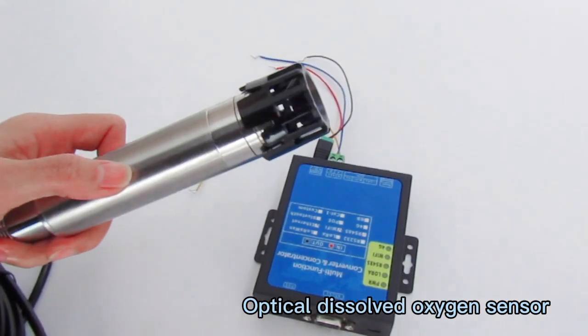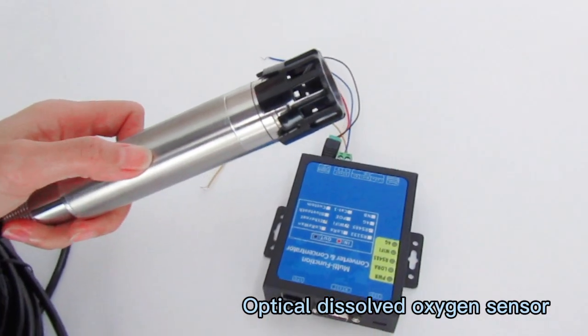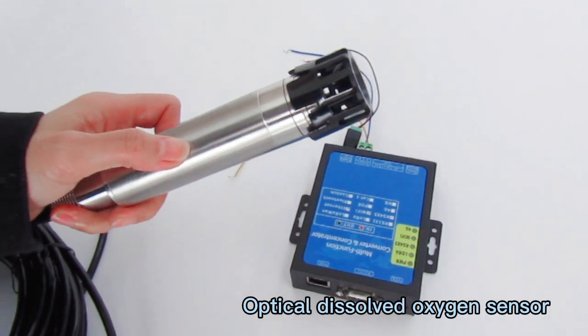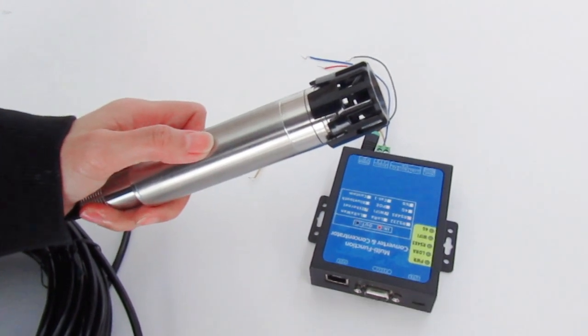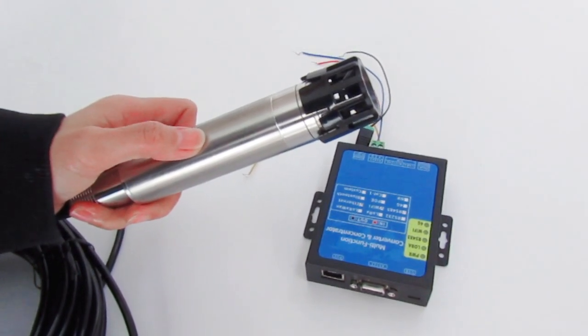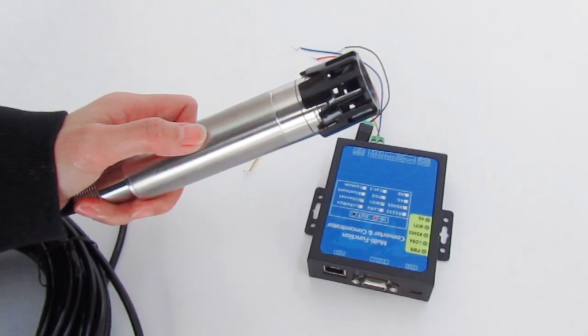Using this water DO and temperature sensor, we can test the oxygen content in the water. This sensor can be widely used in aquaculture, especially in fish ponds and rivers.